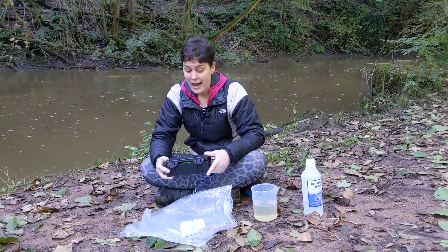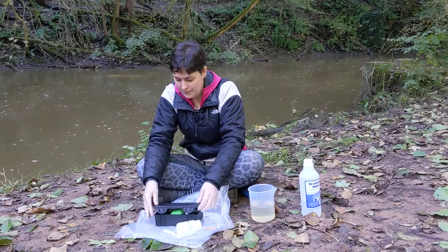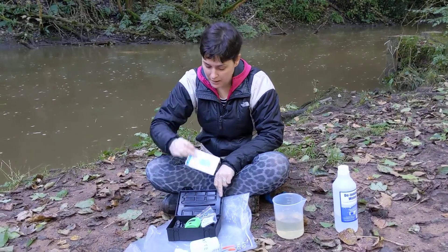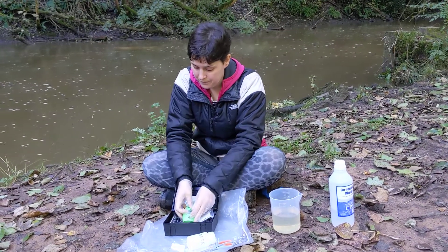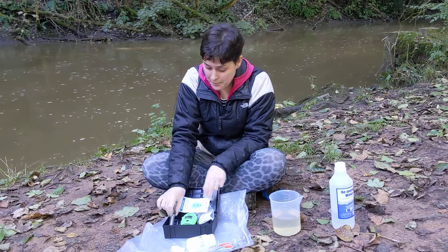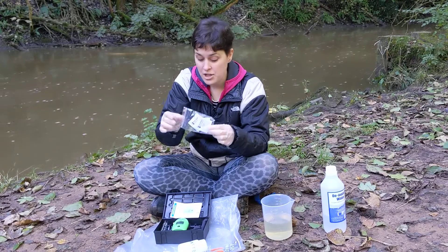To measure phosphate using the HANA checker, I've got a little box like this. Inside you'll find an instruction manual, your phosphate checker, two glass cuvettes with caps, and a package of reagents.